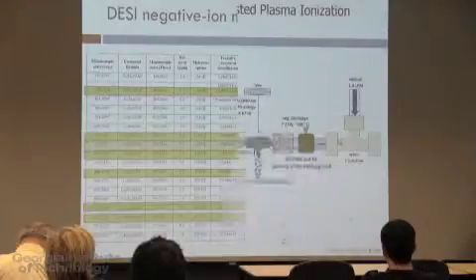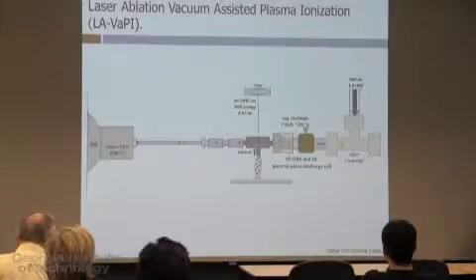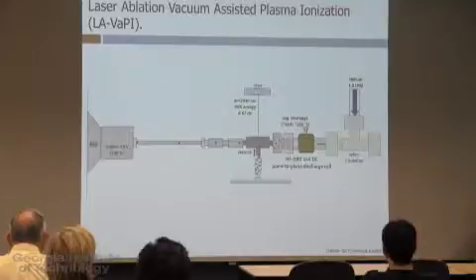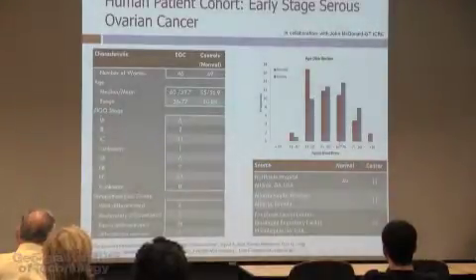So we are really gearheads, and we're really interested in developing a new technique. We've been developing a new technique for imaging. We use a third way of making ions, which is a plasma, an electric plasma, a spark, and a laser. Okay, so this is not ready for prime time in terms of using precious samples, but hopefully if, in the next 12 years, Collie invites me to give another breakfast talk, this will be ready, okay? But we're working on this.